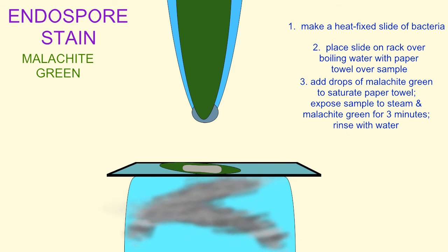Over the course of three minutes or so, the steam allows the malachite green stain to enter the spores.